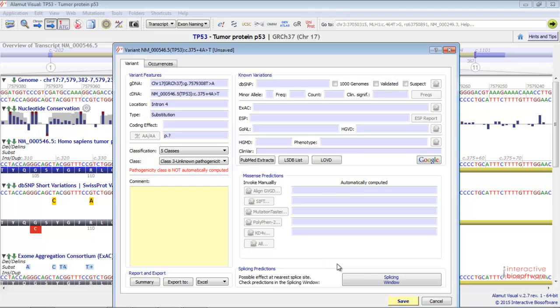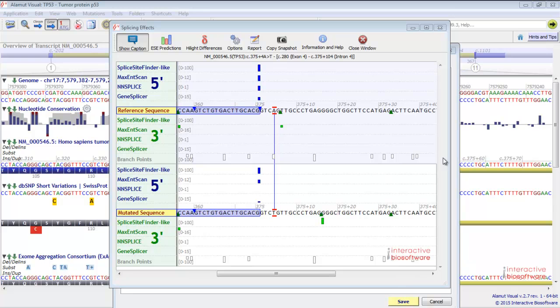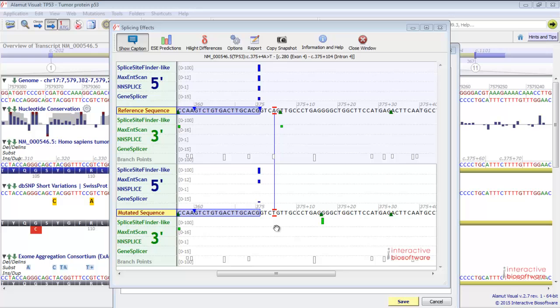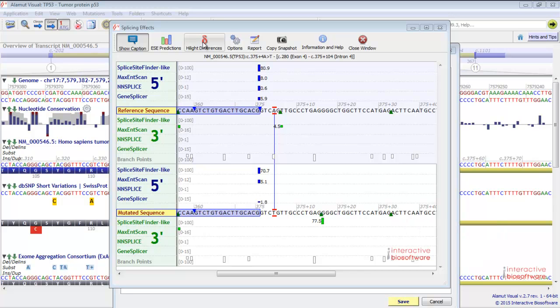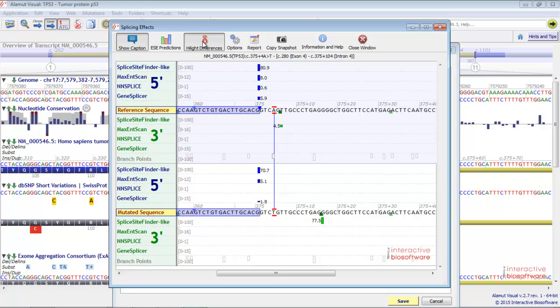You can then have a look at the splicing window by clicking on this button. Here is the reference sequence and here is the mutated sequence. Several splicing predictors are available in Alamut Visual. Vertical blue bars represent splicing donor signal predictions. Vertical green bars represent the acceptor signal predictions. Known constitutive splicing patterns are displayed as blue triangles for donor sites or green triangles for acceptor sites. You can also highlight differences between the reference sequence and the mutated sequence here.